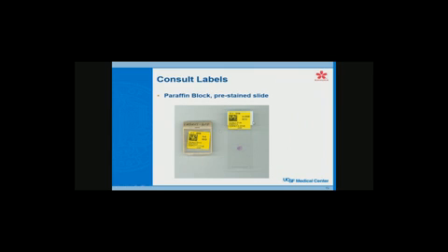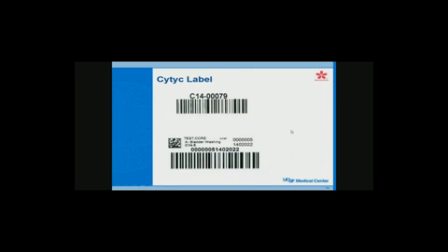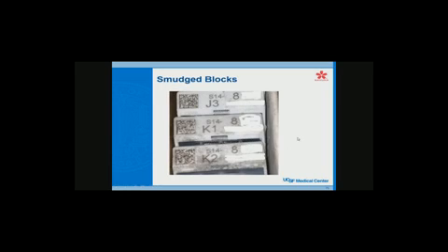So at the end of this, when you finally go live, nothing is perfect, so you're going to have some problems. The big thing is to start an issues log and perform the analysis. This is our issues log that we had set up. People just go up and write up any issues that they had with the system, and then we would, as soon as possible, try to resolve it.